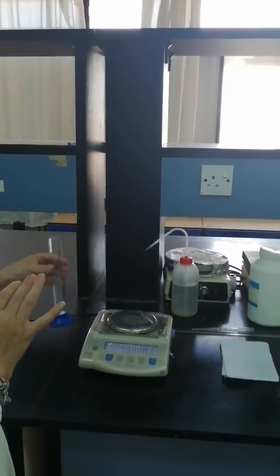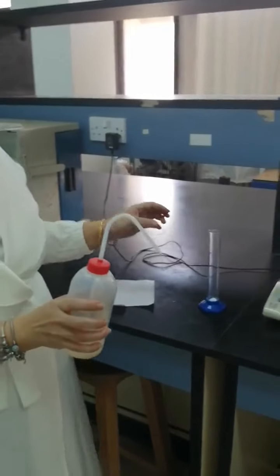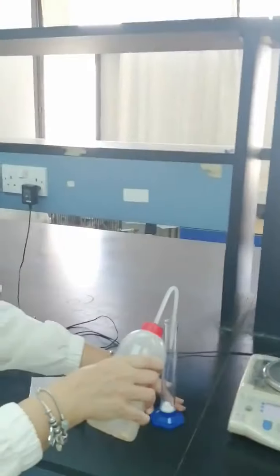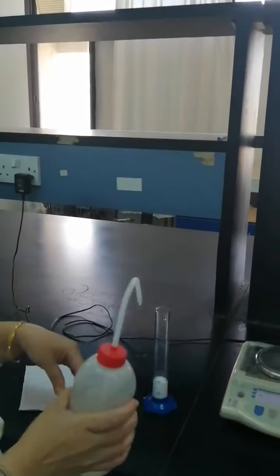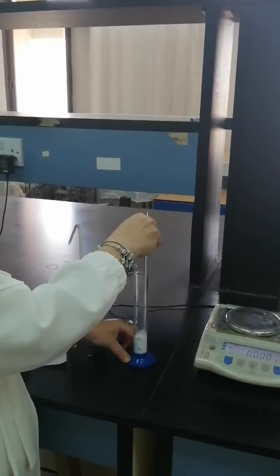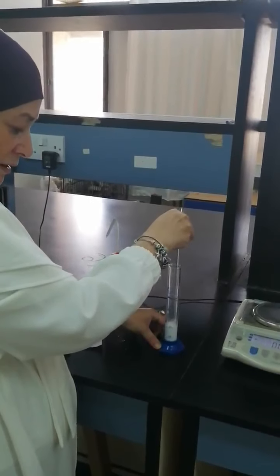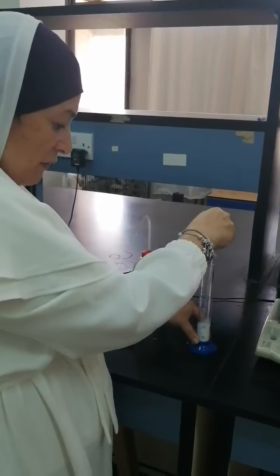Then the next step is adding the replacement liquid, which is water. As we said, we will add water up to 20 ml, because zinc oxide does not dissolve in water and it is just wetted by water, and we have to enhance water entering between the particles and intervoids. We have to stir it because we have very fine zinc oxide.